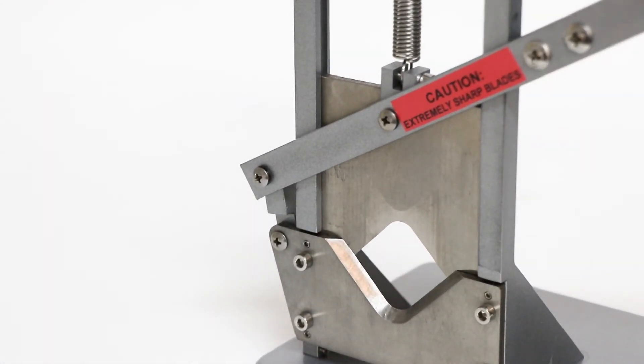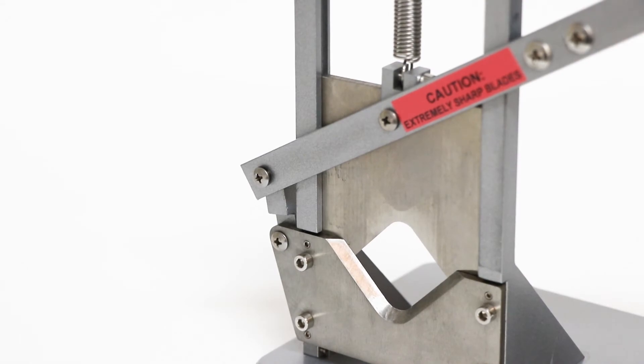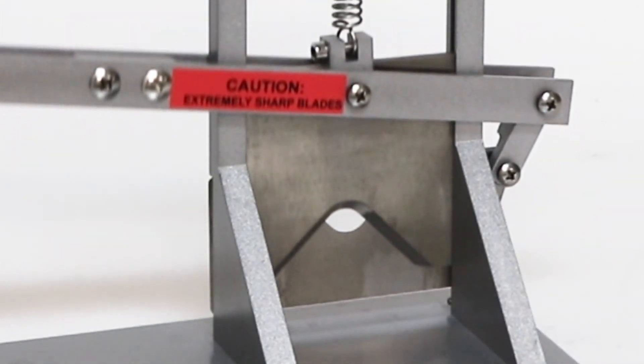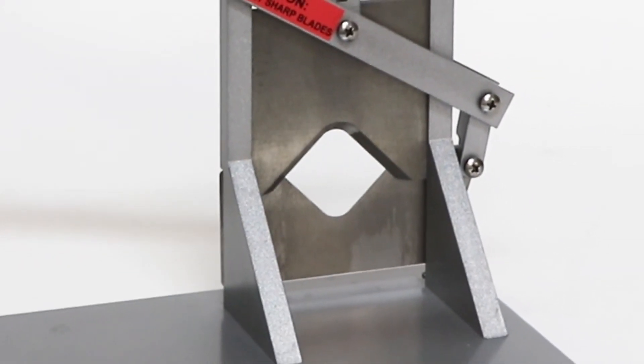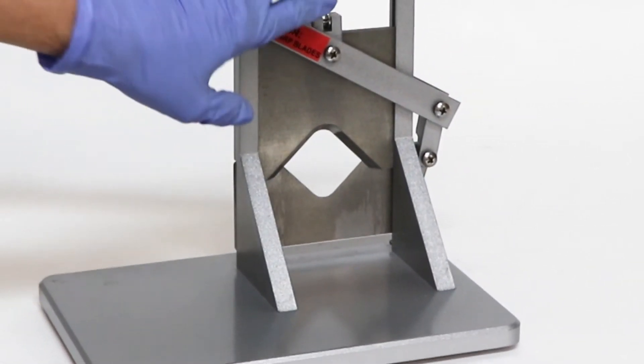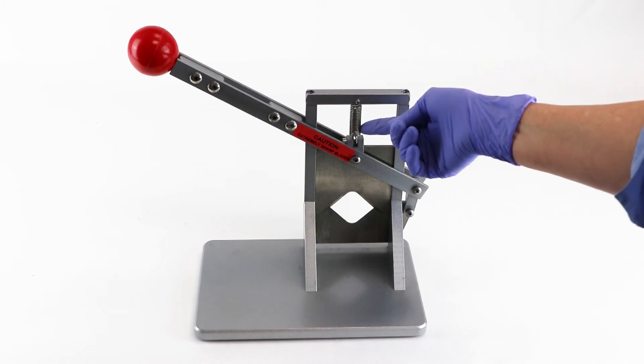Sharp blades make the process swift for both the researcher and the subject. And with proper care, the stainless steel blades resist corrosion too. The heavy-duty spring at the top of each guillotine securely holds the blade in an open position.